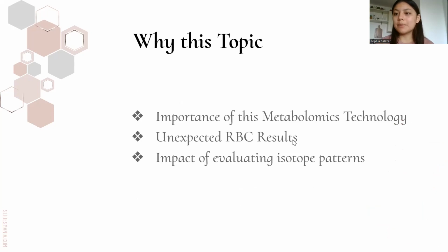So now I'm going to talk about the purpose of my research and why I chose it. My research really explores the importance of metabolomics technology like the liquid chromatography mass spectrometer, or the LCMS. This is really interesting and important because technology like the LCMS helps further technology and metabolism as it analyzes the activity of metabolic pathways and how particles like carbon move through these pathways. It also promotes more advanced technology and more discoveries in biology and medicine.